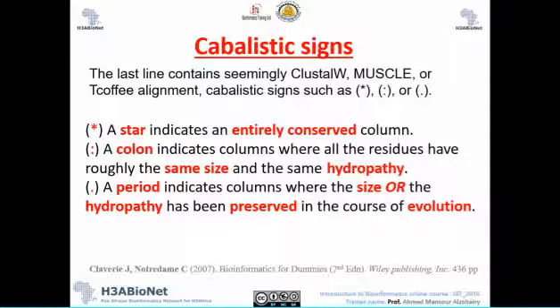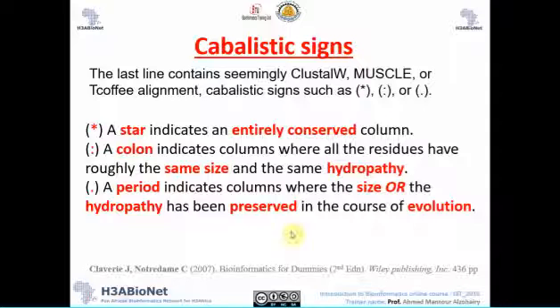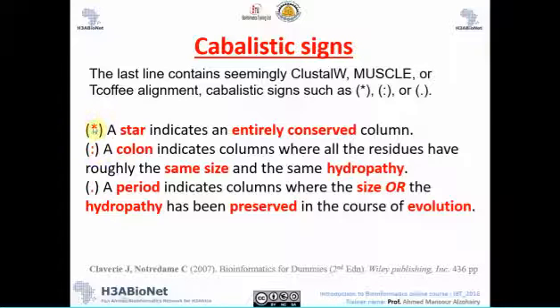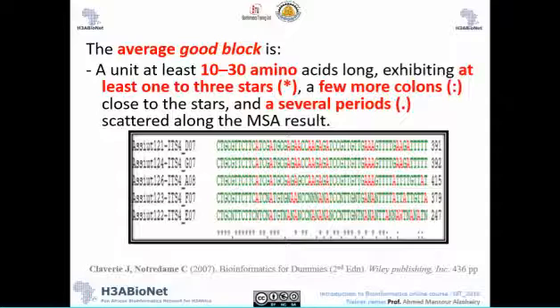You have to understand the meaning of the conservation symbols. A star indicates an entirely conserved column. A colon indicates positions where residues have roughly the same size and hydropathy — also a good indicator. A period indicates positions where the size or hydropathy is less conserved. So we have star, colon, and period — these signs are very important to interpret your degree of conservation.